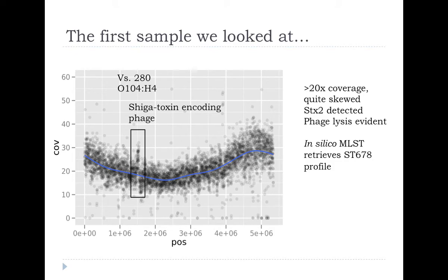And what we end up getting here is, for each position in that genome, between 20 and 30-fold coverage. So there are at least 20 different sequences in the metagenome aligning. That's about what you'd expect to get if you were trying to sequence this genome from a colony. That's the kind of coverage we aim for, so we're very pleased with that. You can see that there is a sort of skew in this alignment, and that's because when you have rapidly growing cells, the origin of replication is overrepresented in the population, whereas the bit just before the origin of replication as you're going around is underrepresented.